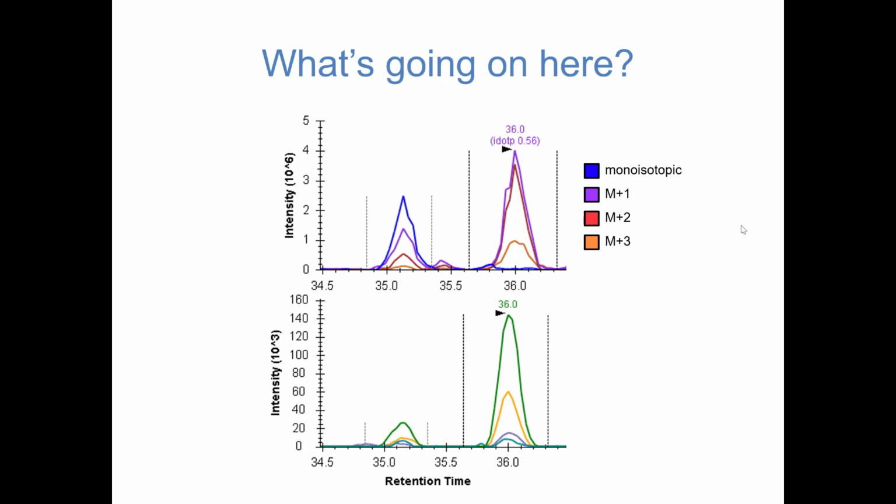These degradation products are important to acknowledge, but it's also important to know that this can be a problem for picking peptides. If you were looking at the precursor scan, you might say this is the form, and if you were looking at just the fragment ion scans, you might say this is the form, but really they're both the same, or really they're both potentially the same biologically important signal.